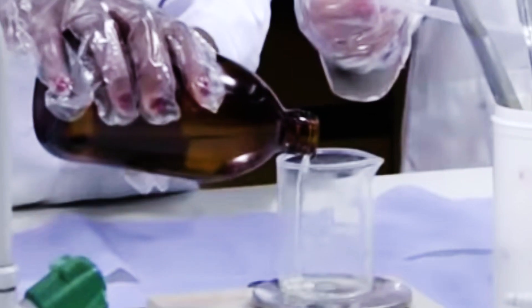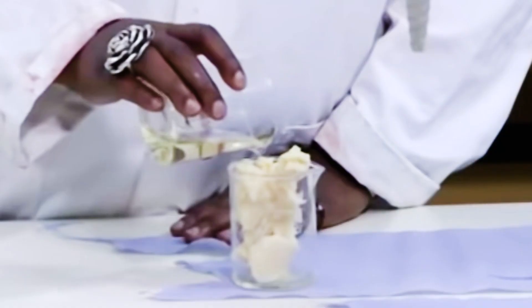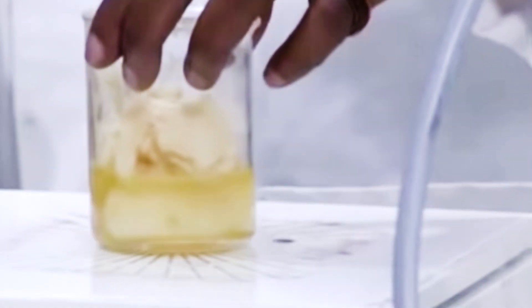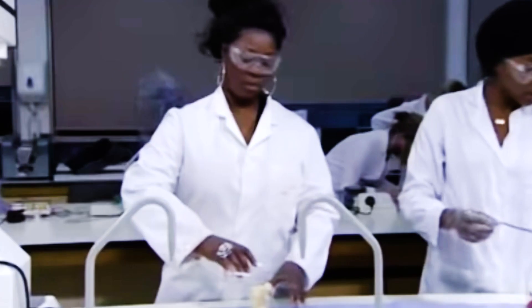Over a decade ago we posted this video of students making lipsticks in the labs at LCF. We posted it on YouTube with no context at all and called it how to make a lipstick. To this day it's still one of our most viewed videos ever because who wouldn't want to know how to make their own lipstick, right?